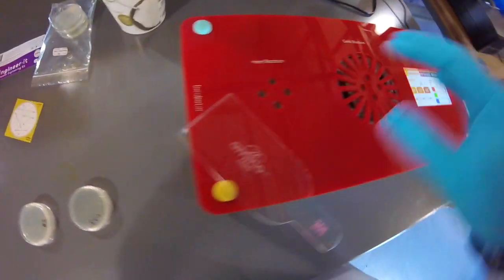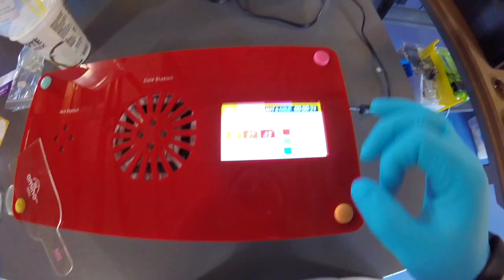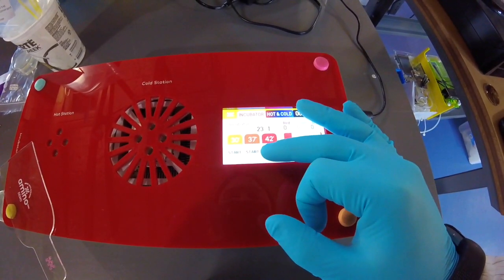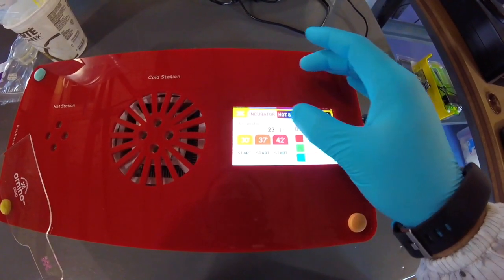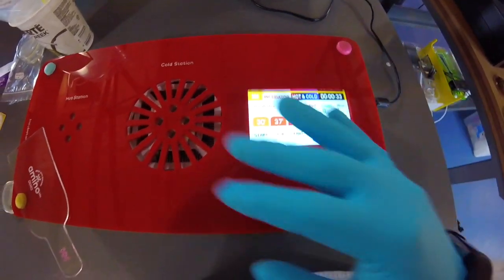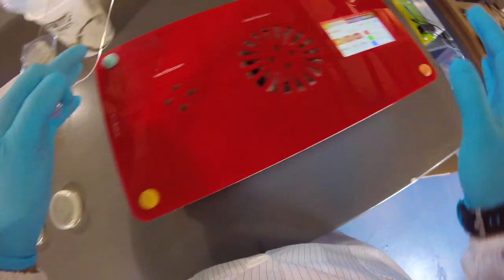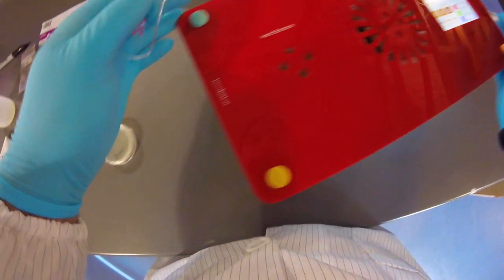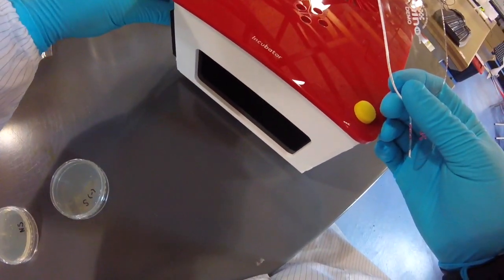And then on the side here, we've got an incubator, and that's where we're going to be putting our Petri dishes. And so in this case, I'm going to press the 37, so that it turns on, and now the incubator is going to start heating up, okay? It can take about an hour for this incubator to warm up because it goes slowly because you're most likely adding kind of cool plates to it.